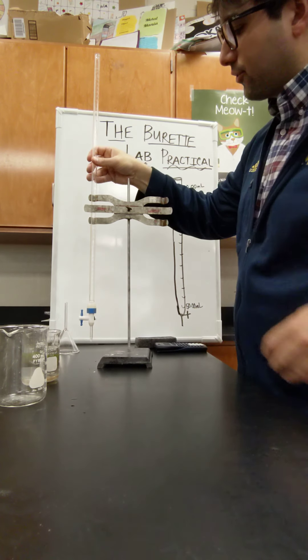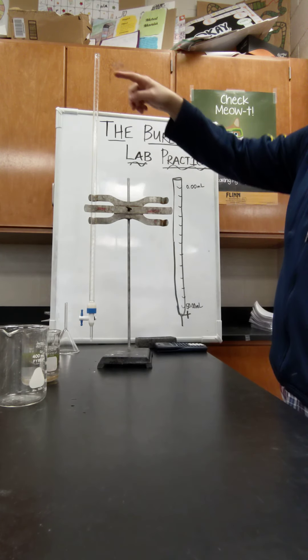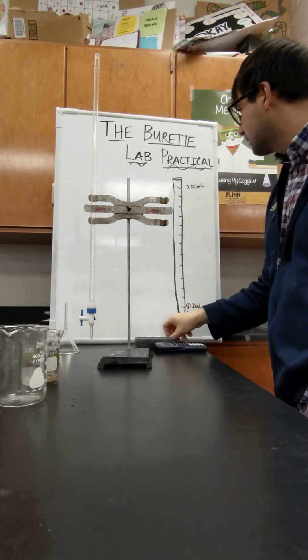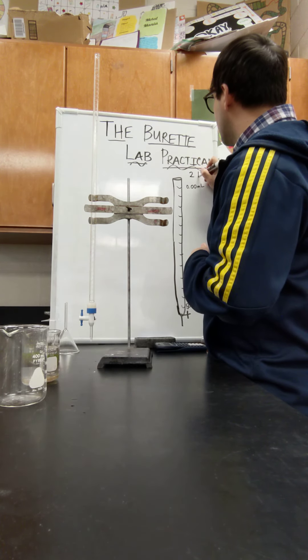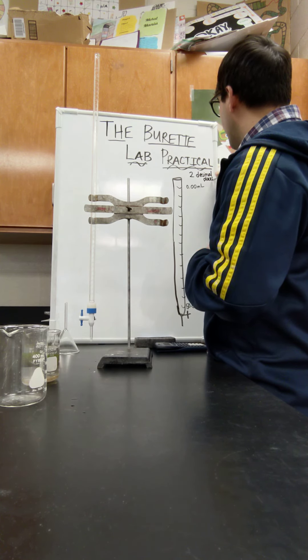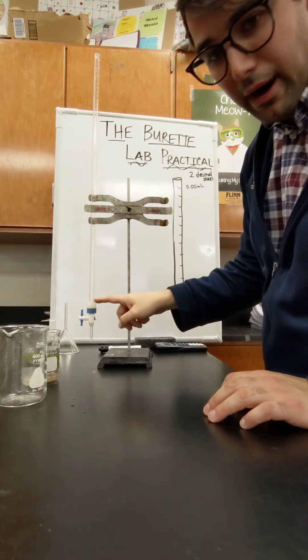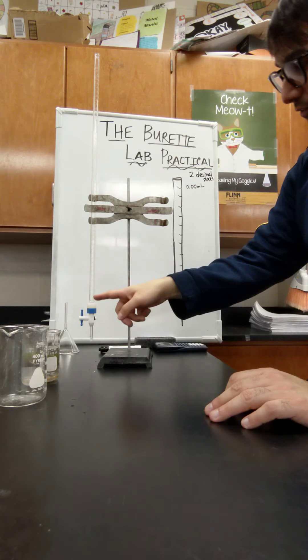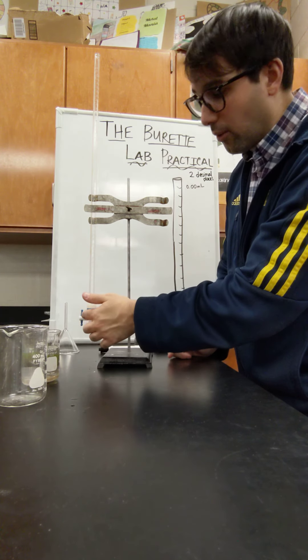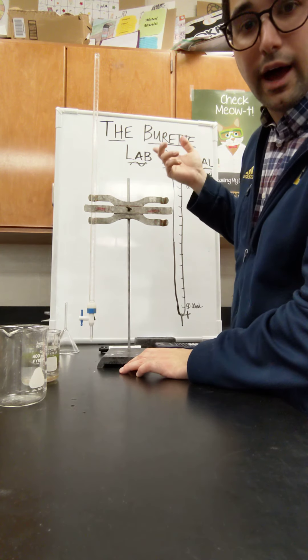If you can read on the burette at the top, I have zero — 0.00. You should be able to read it to about two decimal places. I'm going to ask you to read that for your lab practical. At the top it's zero, and all the way at the bottom is about 50.00. You never want the volume of liquid to go lower than 50 because then I don't know the volume, and you also don't want it to go above zero.